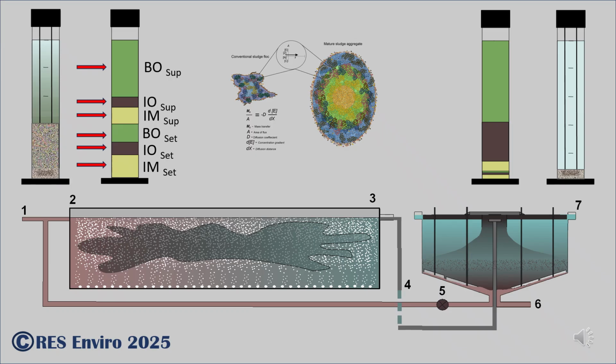The suspended solids value of a sample of mixed liquor is measured in exactly the same way as shown before, with the customary change of using a smaller sample size due to the high solids in the sample. The MLSS value is crucial to keep track of the accumulated solids of the biomass culture suspended in the bioreactor.